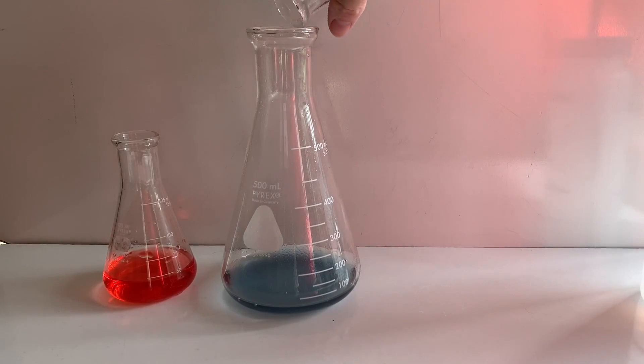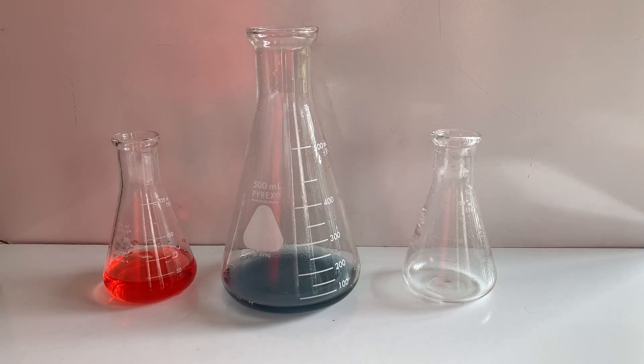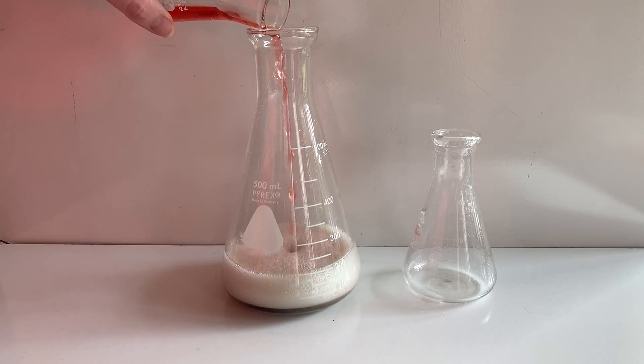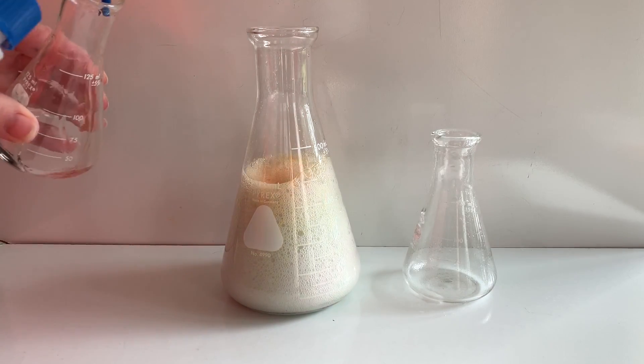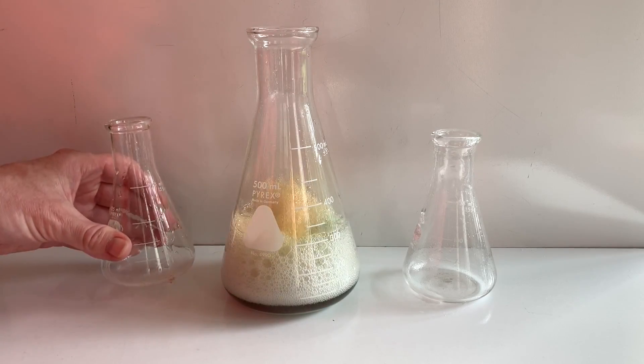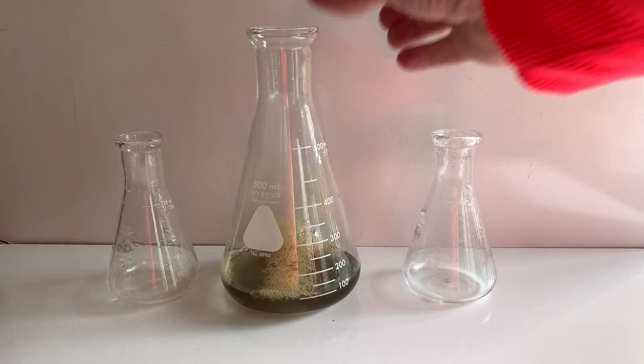There will be a limiting reactant and an excess reactant in this reaction that we'll have to calculate using stoichiometry. I will write the balanced equation which will prove that the gas that's being produced is carbon dioxide. Take note of the color of the universal indicator when this reaction is over. It'll give you an indication of which reactant was limiting and which one was excess.